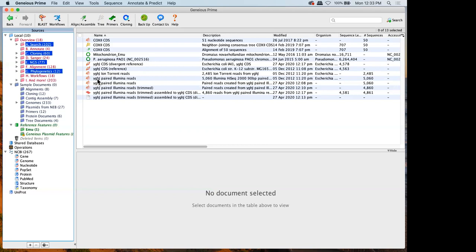Yeah, we don't have any interface between Geneious and the Tufts cluster right now, so the only way that Geneious is going to work is on a desktop. I know that there is a Geneious server version, but as far as I could tell, that really takes away from the graphical user interface, which is why a lot of people like Geneious. It's something I haven't explored too much, and as far as I know, that's not the direction we're going to go in.